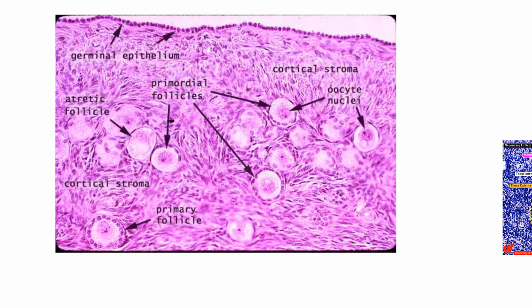That's a primary follicle. Now some people call it a secondary follicle when you have two of these layers. Others don't. So be careful to understand that there are a couple of ways to classify things. Atretic follicles means it's dying. And you should know, and we probably stated this before, more than 99% of all follicles undergo atresia. Okay, so this is an atretic follicle. It's going to basically disappear. Okay, let's get that out of the way.